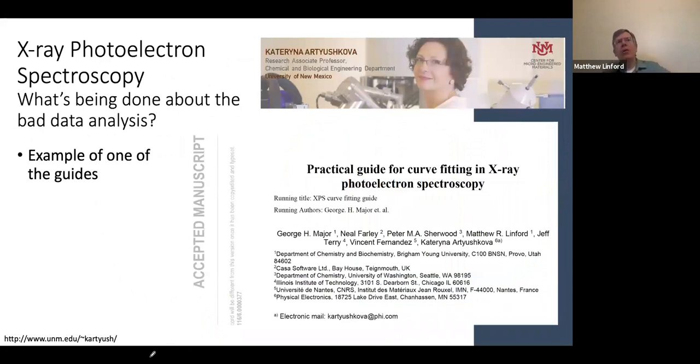So what's being done about this? Well, I think the short courses that SVC is putting together are so incredibly timely. And I do want to emphasize that the errors we're seeing in the literature are not just with XPS. If you talk to experts of other material characterization techniques, you're finding the same levels of errors appearing, whether that's AFM, TEM, or whatever it may be. People are under a lot of pressure to publish. In general, when you publish, you're expected to use multiple characterization tools and show data from multiple characterization tools.